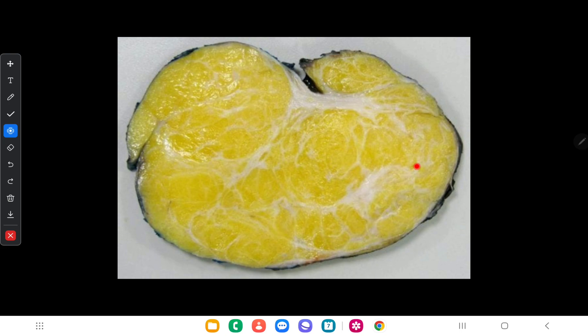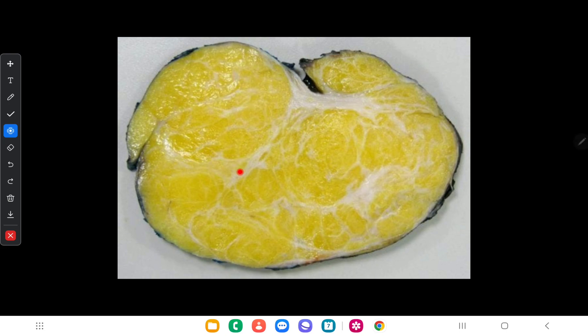Next we will discuss tumors which originate from adipose tissue. The benign tumor is called lipoma and the malignant tumor is called liposarcoma. Here you can see a cut section of lipoma. Its macroscopic appearance is well-circumscribed with a lobular cut surface, homogeneously yellow in color with a fatty appearance, divided into lobules by fibrous septae visible in whitish color.